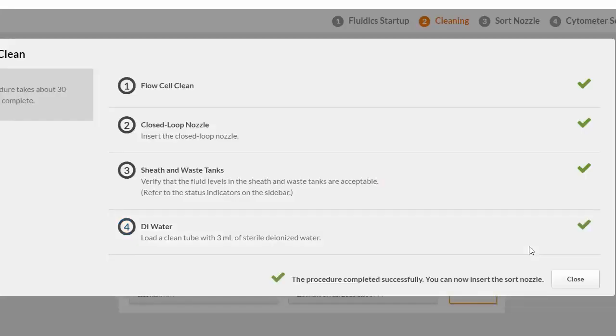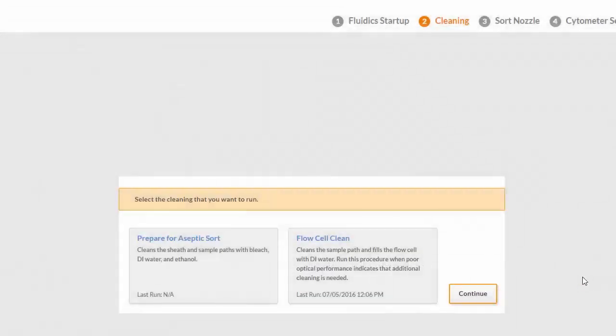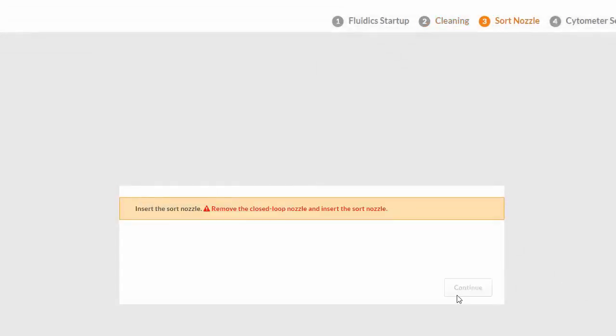After the cleaning is complete, click Close and then Continue. The system displays a dialog to insert the sort nozzle.